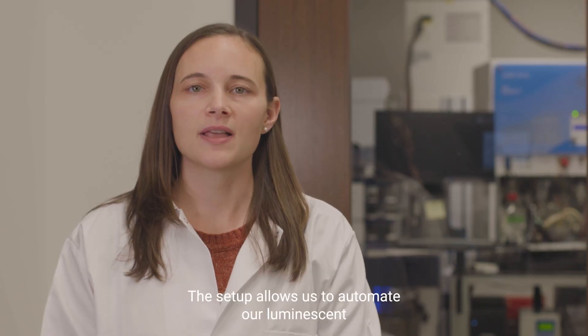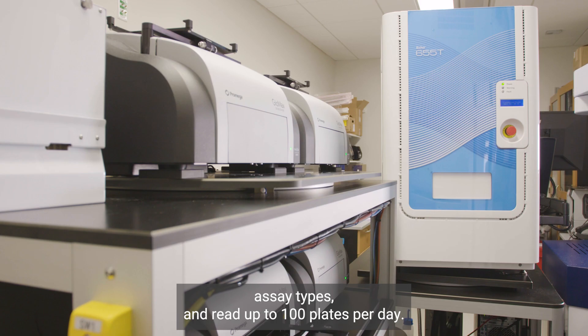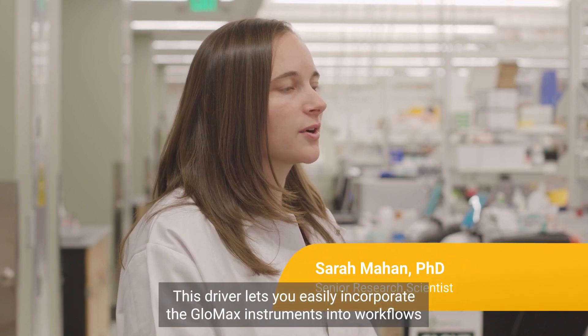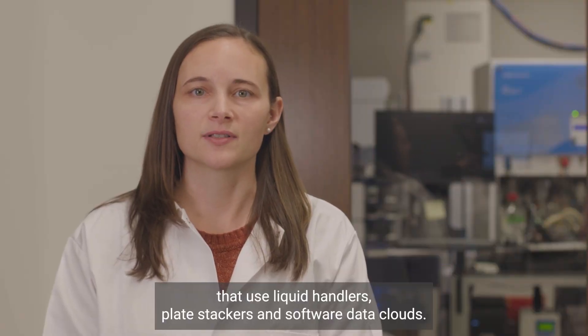This setup allows us to automate our luminescent assay types and read up to 100 plates per day. The GloMax Discover comes with a SiLA 2 driver built into the instrument software. This driver lets you easily incorporate the GloMax instruments into workflows that use liquid handlers, plate stackers, and software data clouds.